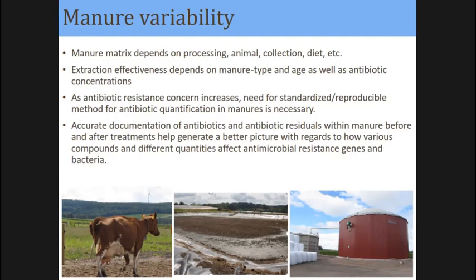Thinking about manure, you have manure coming from different animals. You have manure that's undergone different processes. Like Stephanie talked about, manure when it goes into the digester is much more solid than it is when it comes out. And depending on what animals are eating, which animal the manure is coming from, and the antibiotic concentrations, diet, all those things are going to affect your ability to recover the antibiotics and actually extract them and measure them.